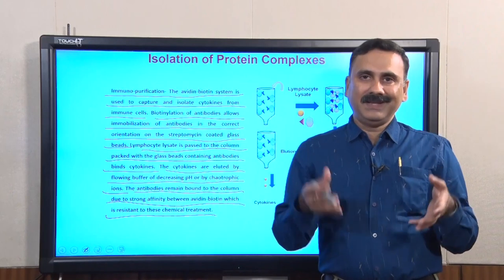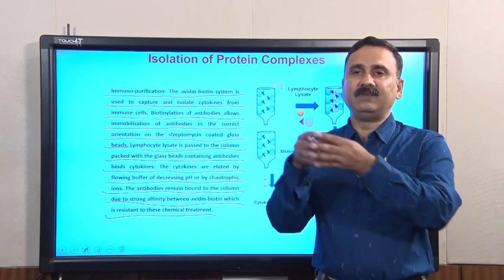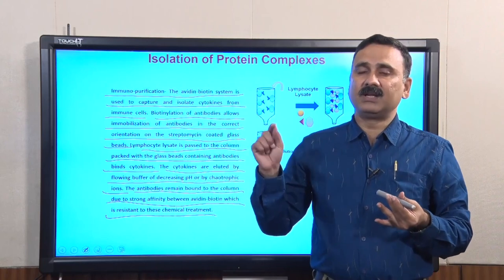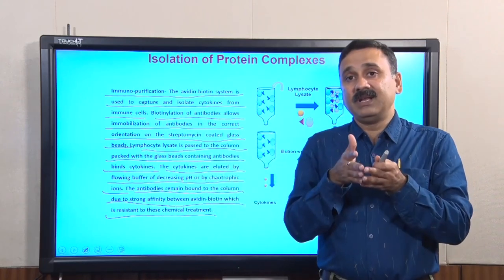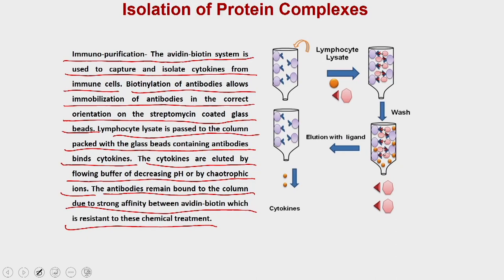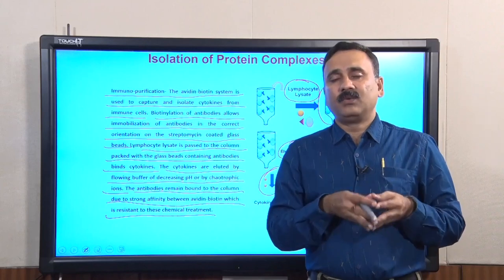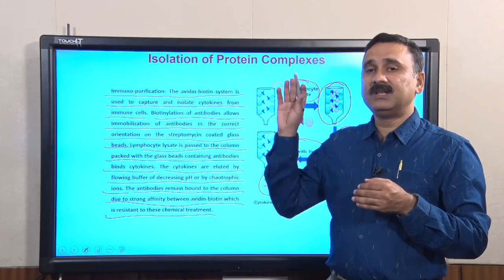Apart from isolating the cells, you can also study the cytokine profiling from these cells. Every cytokine is going to have its antibody, so you can use that antibody coupled to the avidin and biotin system. Avidin has a very strong affinity for biotin, so you can take the lymphocyte lysate and pass it through the column which contains this particular kind of antibody, then you wash and elute with the ligand. When you do the elution, only those cytokines will come which have affinity for the antibodies present on these beads, and that's how you can identify the cytokines which are being secreted from these lymphocytes.